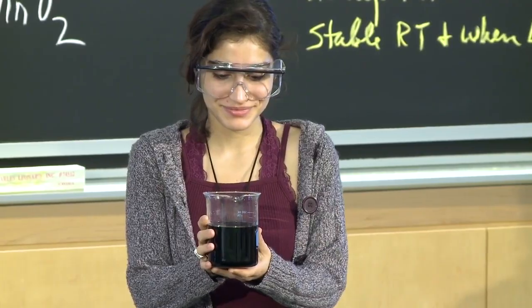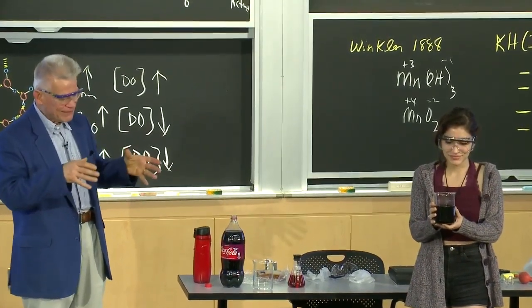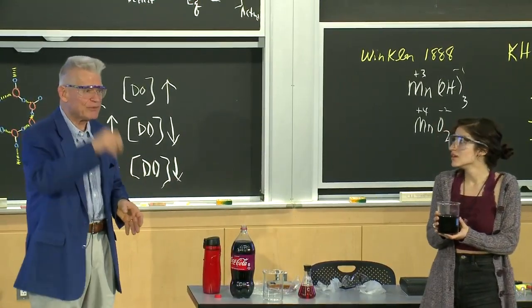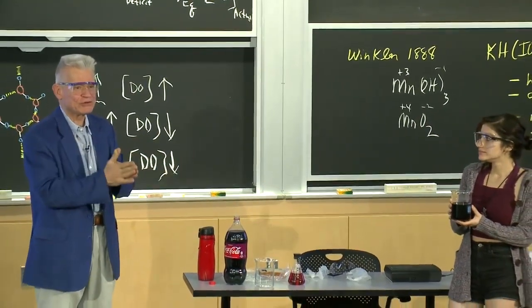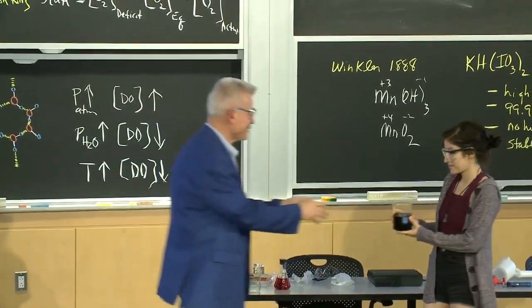Don't get nervous. Oh, now that's what I'm talking about. You see that? This is what we're talking about. I mean, you know, you're titrating. You can't see the end point. You put this in. Now, that last drop of titrant is going to turn it clear. You're going to be able to see your titration. Thank you very much, Maida.